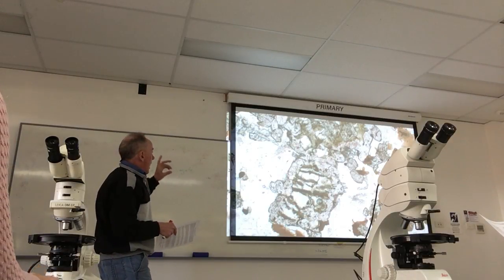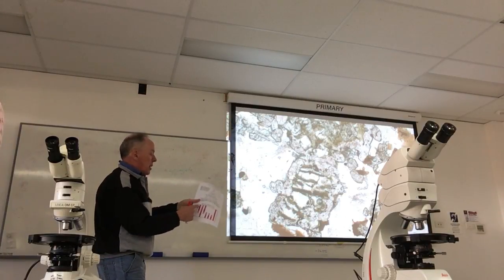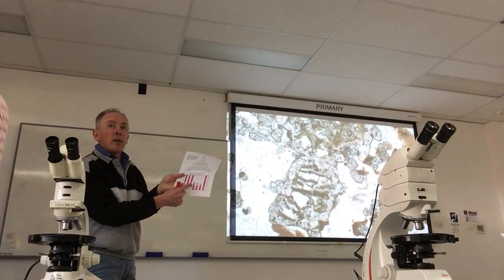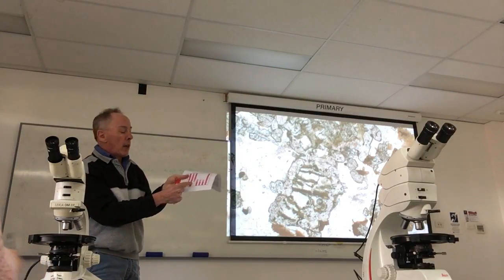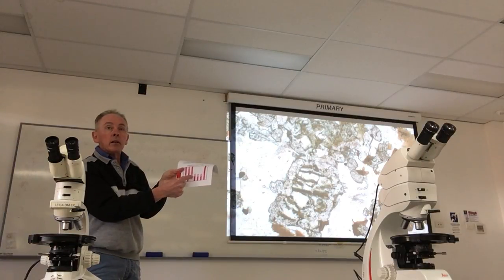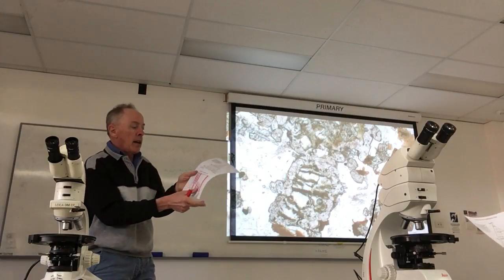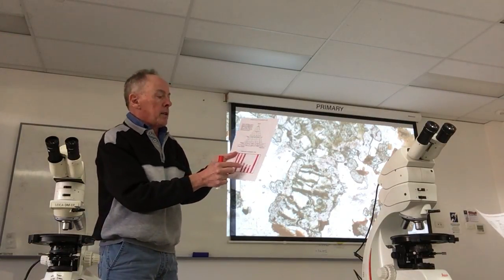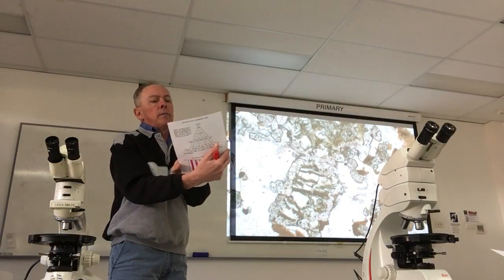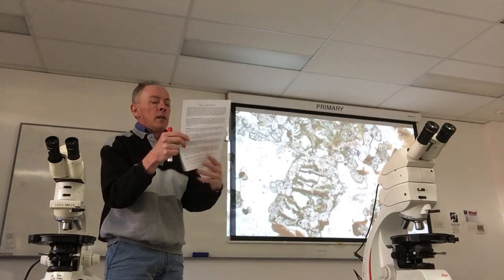Okay? Anhydrous minerals won't necessarily, so orthopyroxene, you can see in this one, and augite have both stopped when the water content's got too high. Now, I haven't written that there, but that's the reason behind it. This is just observation. Both of the pyroxenes in that particular slide, and this isn't slide 11, it's a similar one. This is actually from Mount Dromedary down the south coast. It's a monzonite as well.